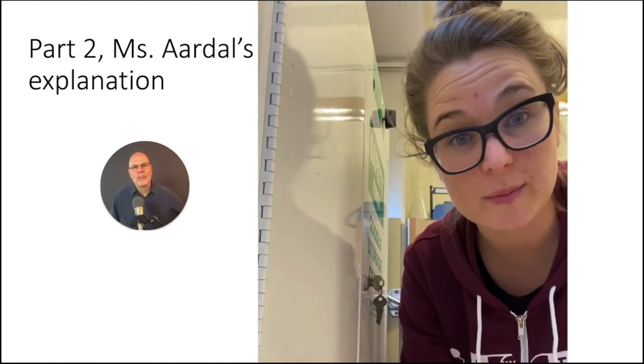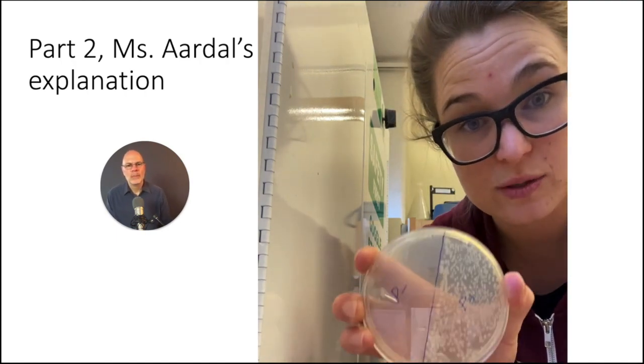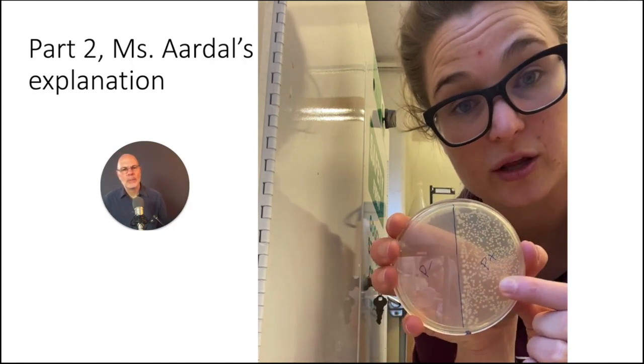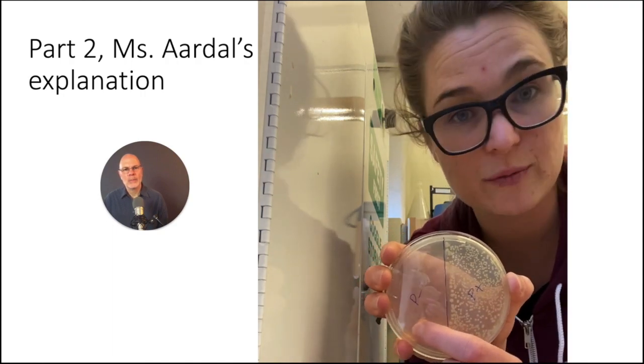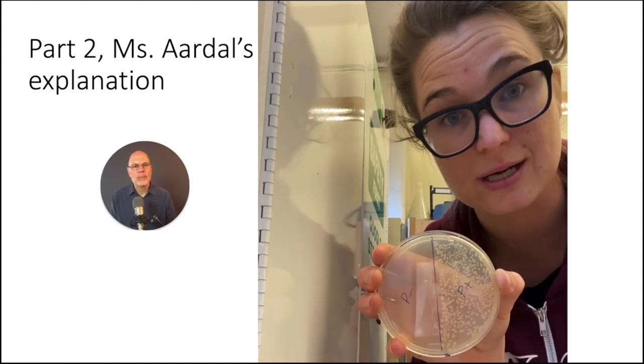Up next, we're going to talk about the LB amp plate. This plate had ampicillin inside of the gel. And you can see that we only had growth of our bacteria on the P positive side, the bacteria that had the plasmid in it. On this side, we did not have the plasmid that had the ampicillin resistance, and therefore these bacteria did not grow.